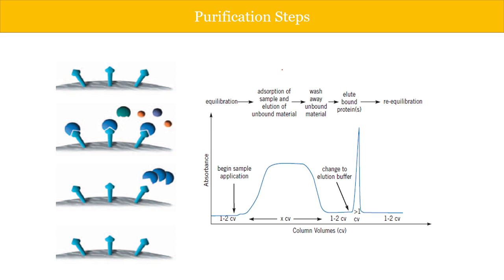And then you have to dip the things all in 20% ethanol, such that there is no kind of fungus growth or virus growth and your column remains good. So this is important. So washing step is also very important, where you have to wash very properly, because you never know who has used the column before and how that person has used. So washing is very important.